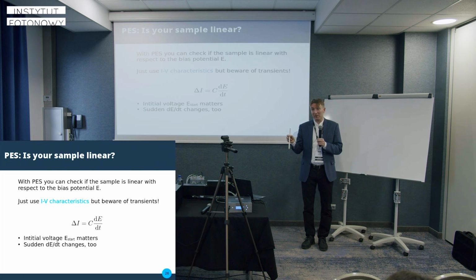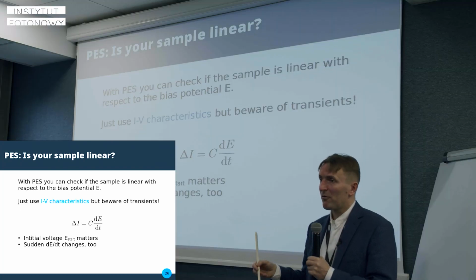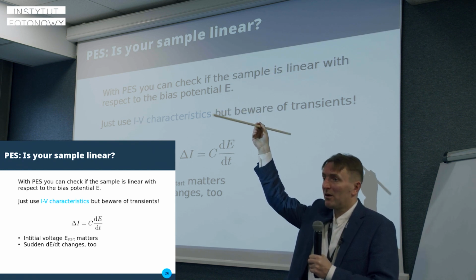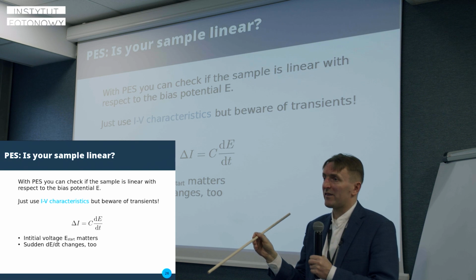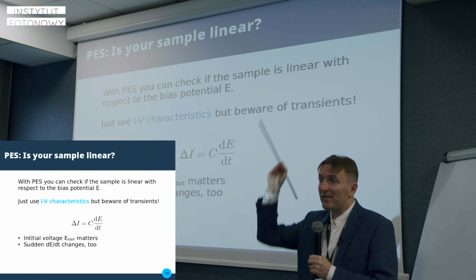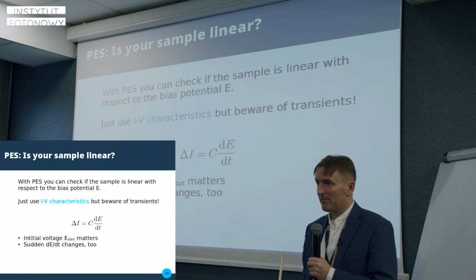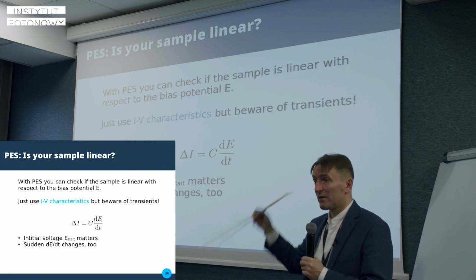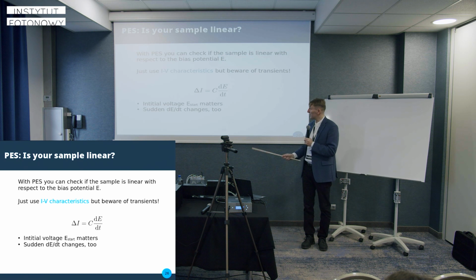I mean, that's the initial voltage. And in order to start the sweep, we needed to go from whatever sample potential was on to this initial starting value. And this great jump caused the spike going down.